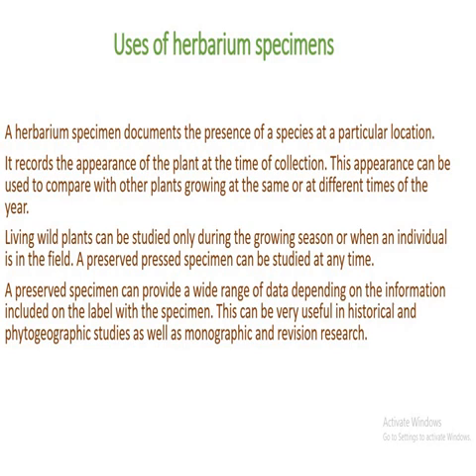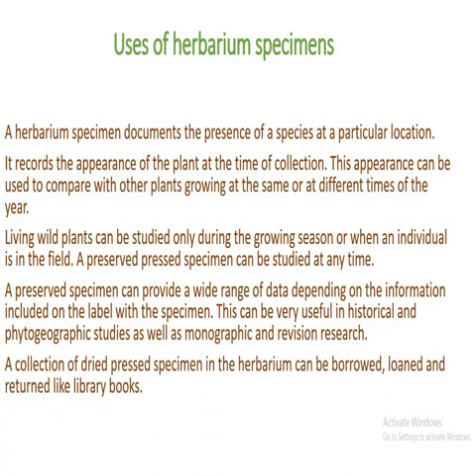The fourth use is that a preserved specimen can provide a wide range of information depending on what you wrote on the label. This information can be useful for historical and phytogeographic studies, as well as monographic and revision research. The fifth use of a good quality herbarium specimen is that you can loan it out just like a library book. So the specimen can be borrowed, loaned and returned at any given time.